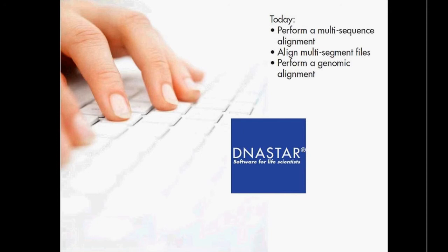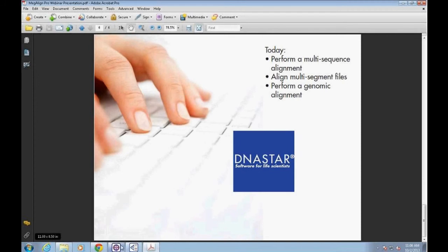So today we'll be walking through 3 different alignment workflows in MegAlign Pro. First, we will perform a multi-sequence alignment. Second, we will go ahead and work with multi-segment files. And finally, we will perform a genomic alignment. So I'm going to get out of the presentation here and go into our software.